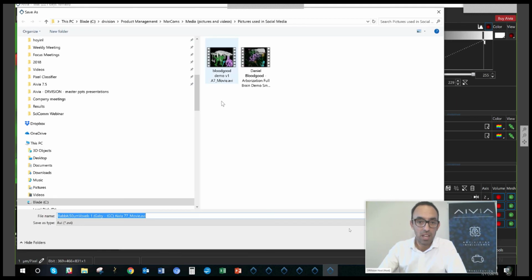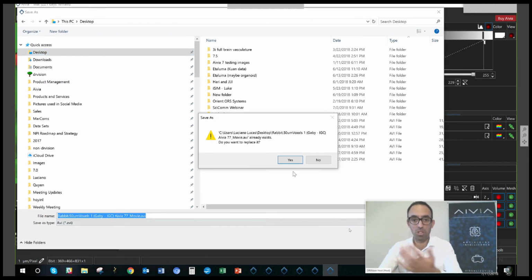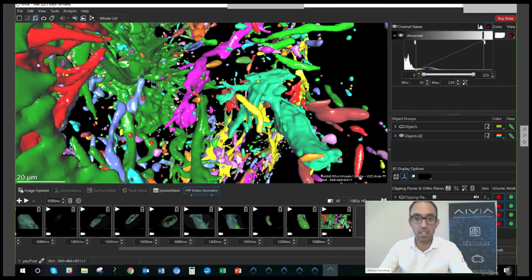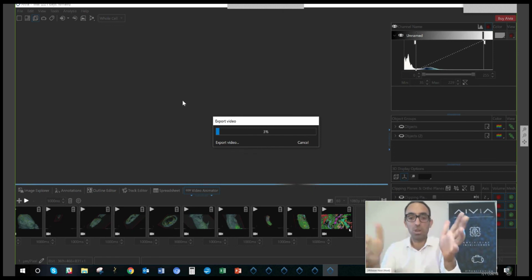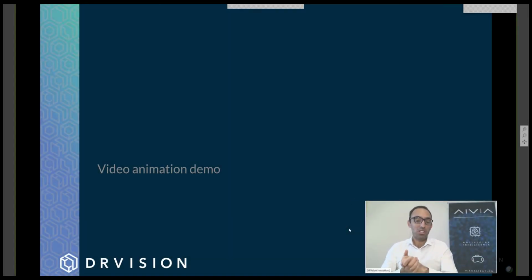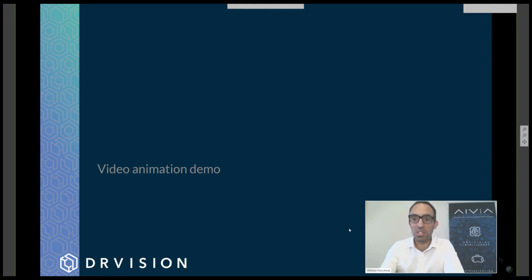And then save. This is going to then save it somewhere on your desktop or somewhere where you would like to have it. So let me. And it's now starting that process. So it hides away the video as it records. And once it records, then you can watch it. I'll leave it recording. It may not finish while we are here. It takes a moment to render the whole thing at high resolution. So that was the video animation demonstration using the ortho slicers and the clipping planes. There's even more options, but for today, I think that's where we'll finish.